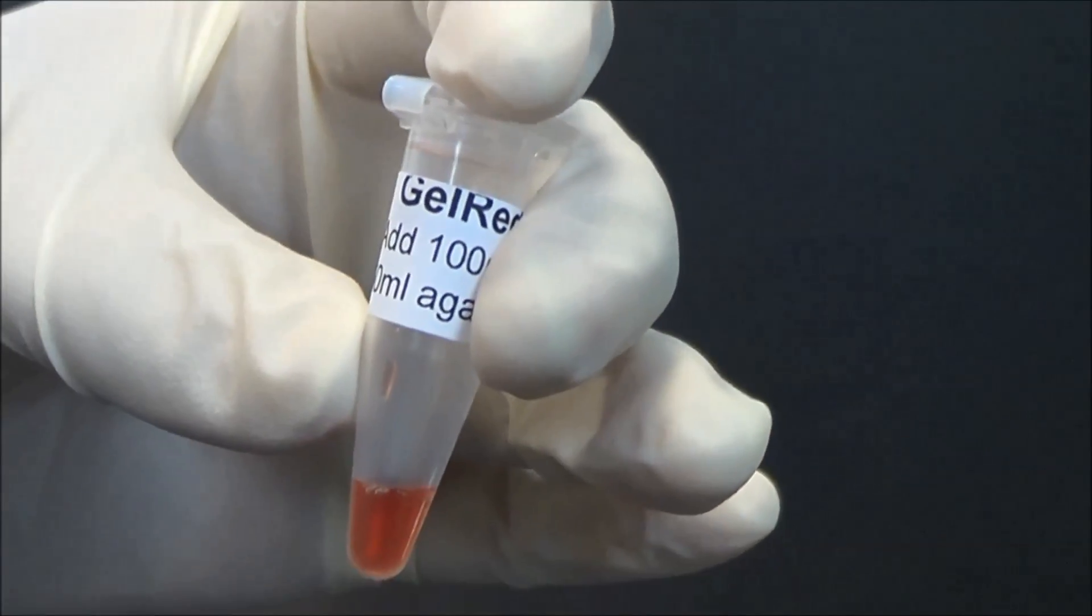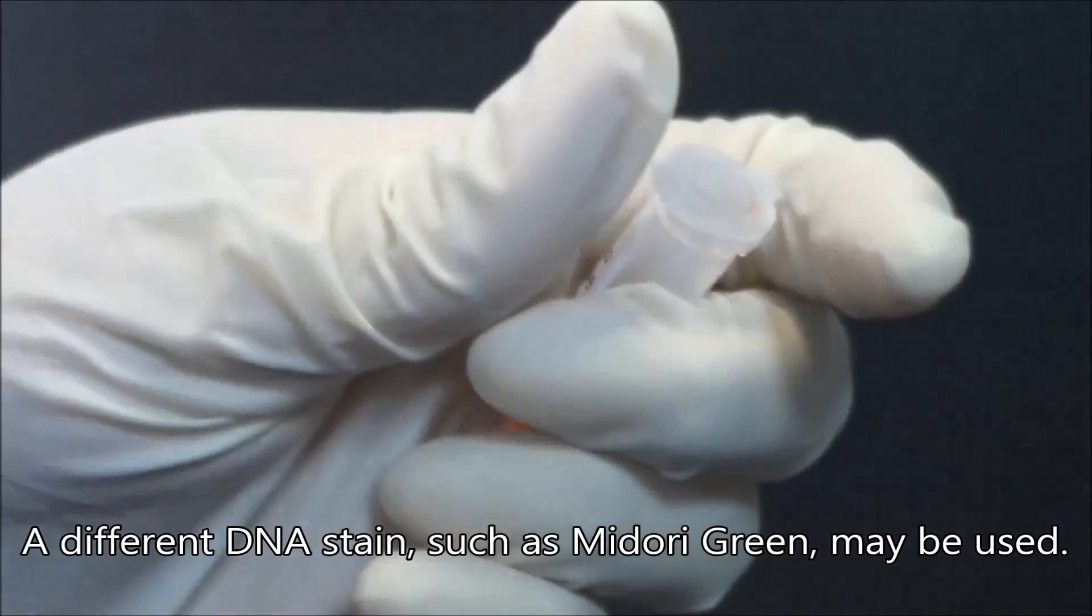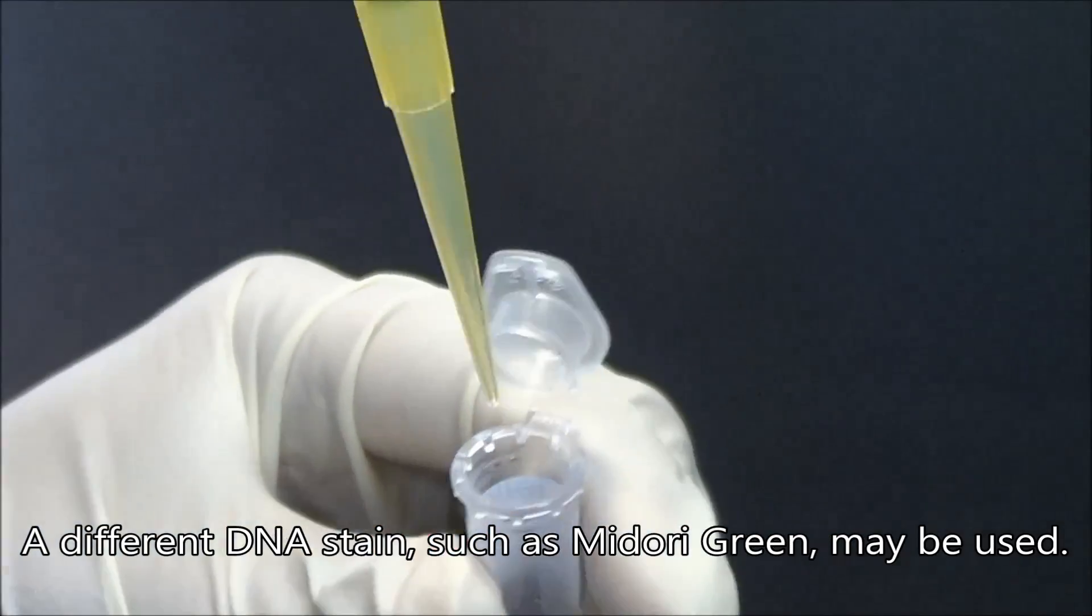To your molten 1% agarose you need to add gel red. This helps visualise your DNA bands under the UV light.